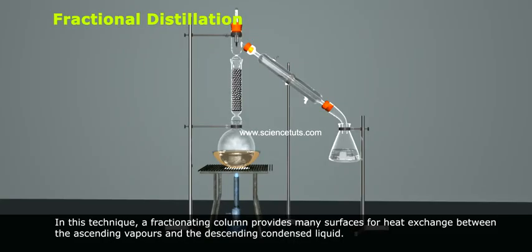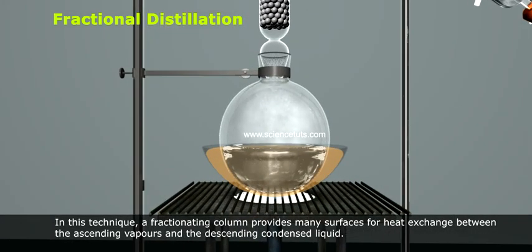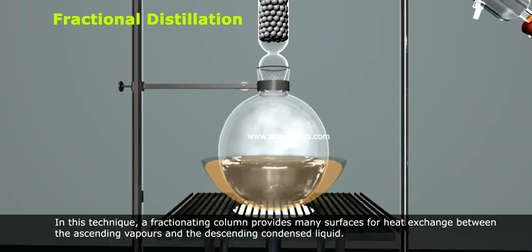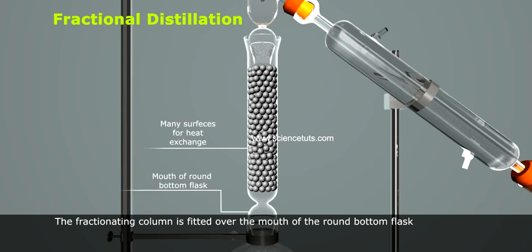In this technique, a fractionating column provides many surfaces for heat exchange between the ascending vapors and the descending condensed liquid. The fractionating column is fitted over the mouth of the round bottom flask.